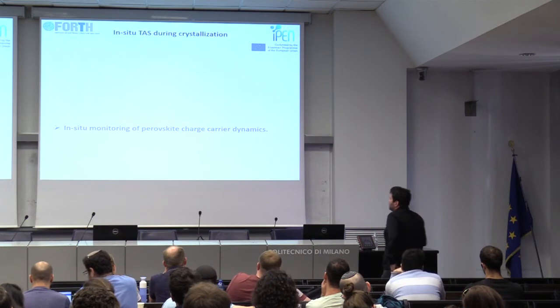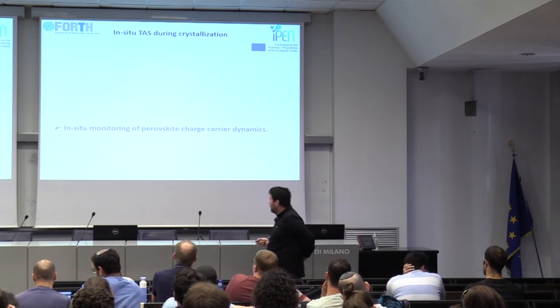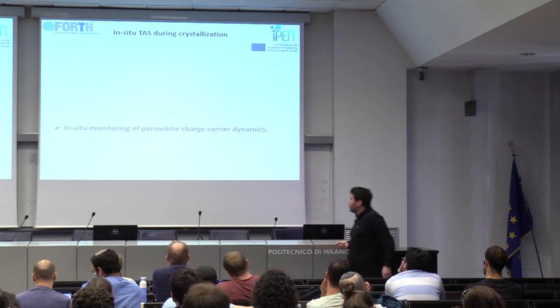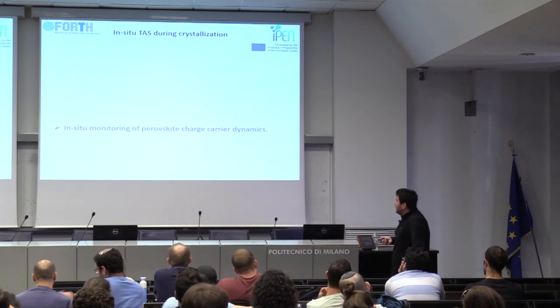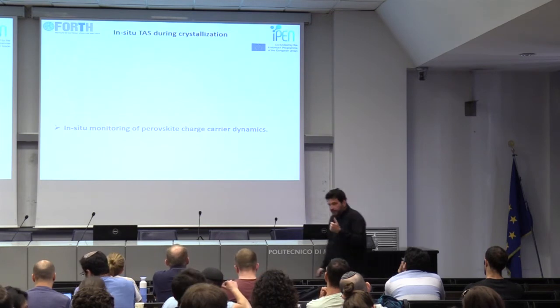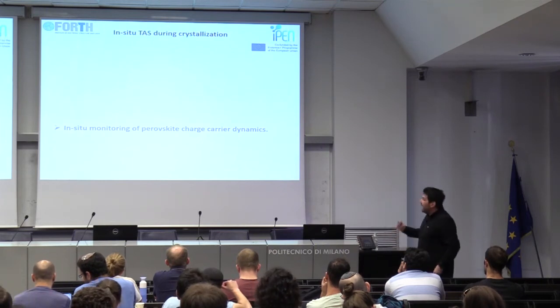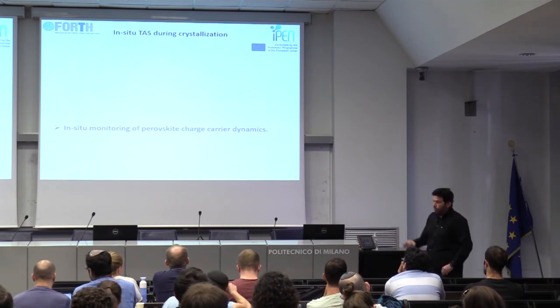Now, let me move to the final set of results that I will show today, which is a demonstration of performing transient absorption spectroscopy in situ while the perovskite crystals are formed.